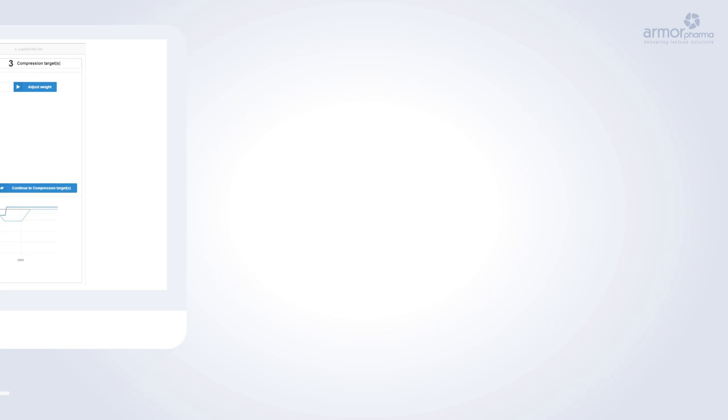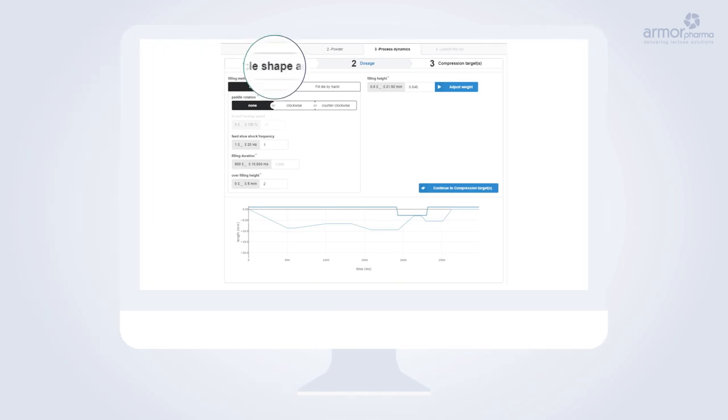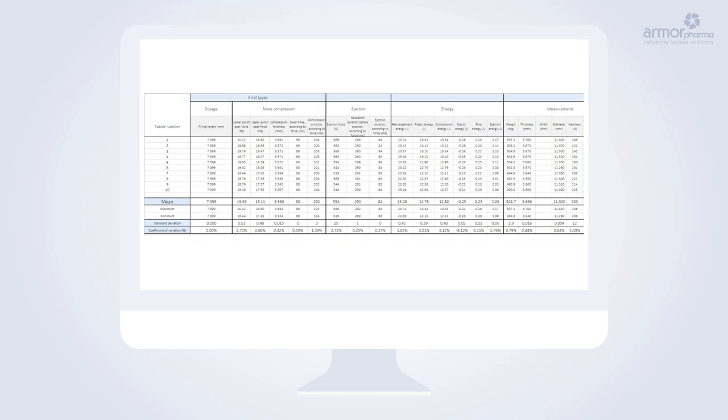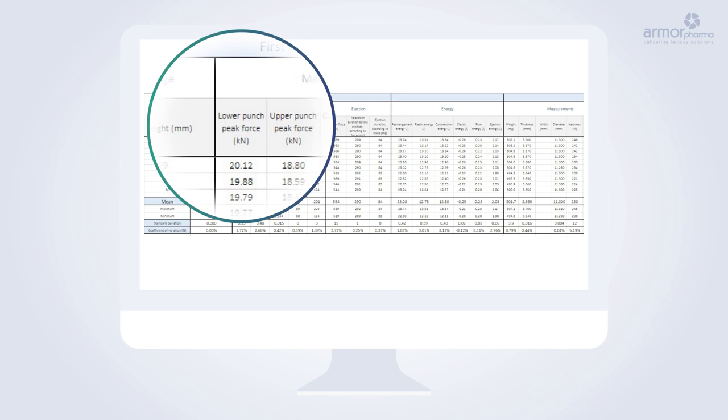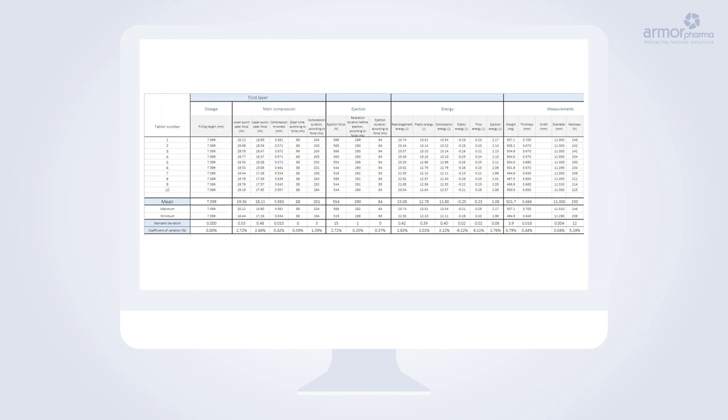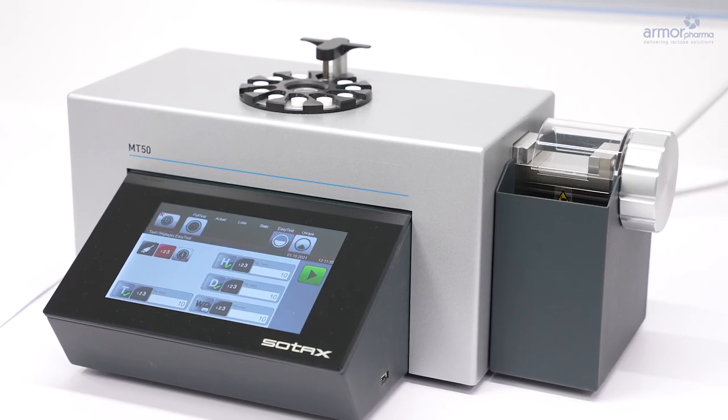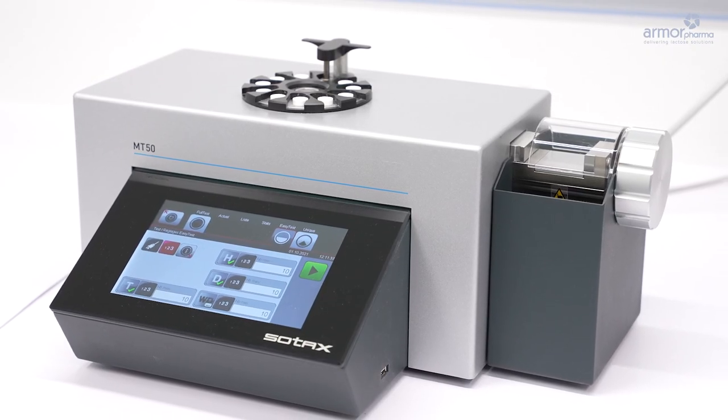The aim is to study the influence of process parameters such as compression force and compression speed on the properties of a formulation. The press is entirely controlled by software allowing automatic data transfer. It also is integrated with all the other equipment to obtain a full set of data of each compaction test.